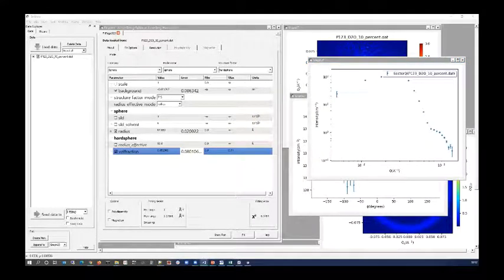I mentioned at the start of the first session that here at ISIS, we not only have SANS instruments, we also have something called a SESANS instrument, a spin echo SANS instrument. There aren't many of them in the world, but there's one at Indiana, there's the one here at ISIS, and there's one at Delft in the Netherlands. And spin echo SANS is a way of accessing very long length scales, but without having very long instruments, which obviously kills your flux. What you do is you actually encode the very small scattering angles in the Larmor precession of the neutron. Remember, the neutron has a magnetic moment.